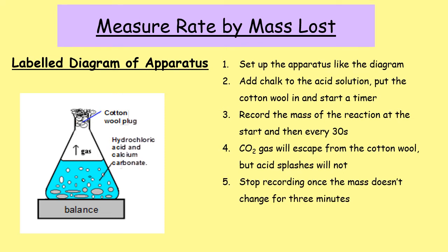You will stop recording, and you can say your experiment is finished, when the mass doesn't change for 3 readings or 3 minutes. And as with every experiment, you need to repeat it 1 or 2 times in order to make sure that your results are reliable.